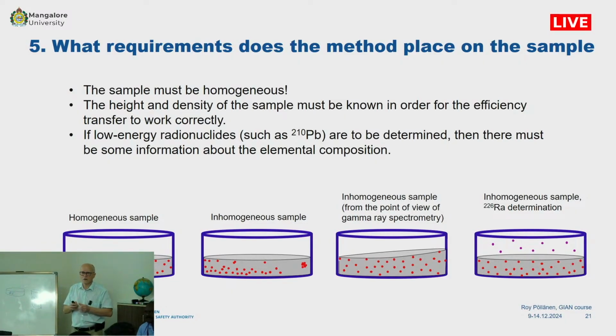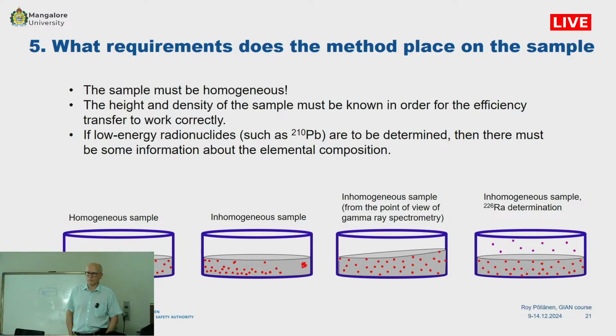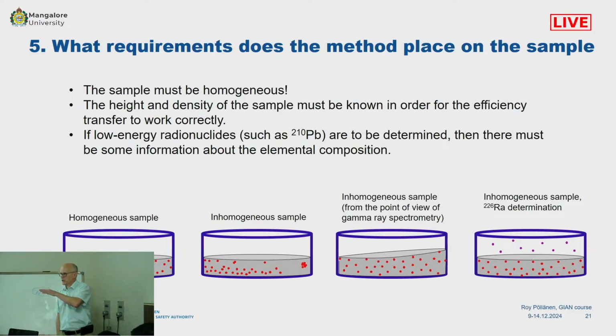What is asking the type of container? Yeah, we have containers in 5 gram of sample, 25 gram, 125 ml, 250 ml like that. And we have a sample holder for air filters, disc type. But in those cases, if the sample size varies, you use different calibrations in the background. We have reference material in the same geometry. Yeah, we can show that. But my point is that, I will show it here.